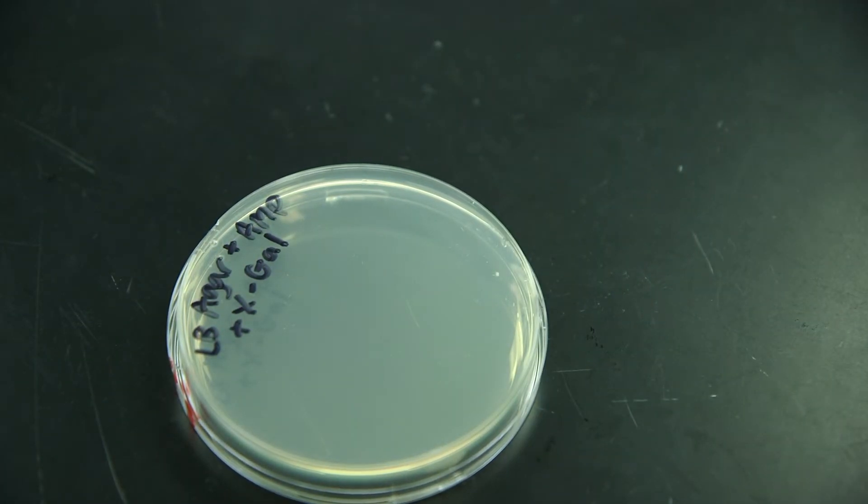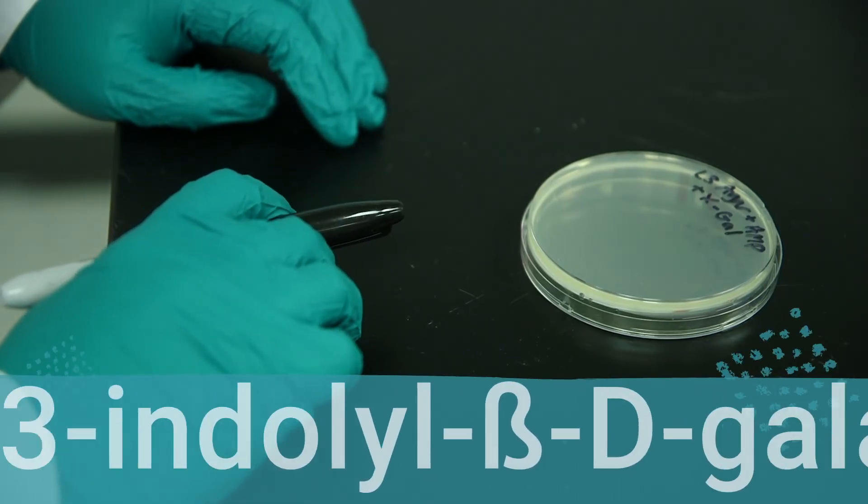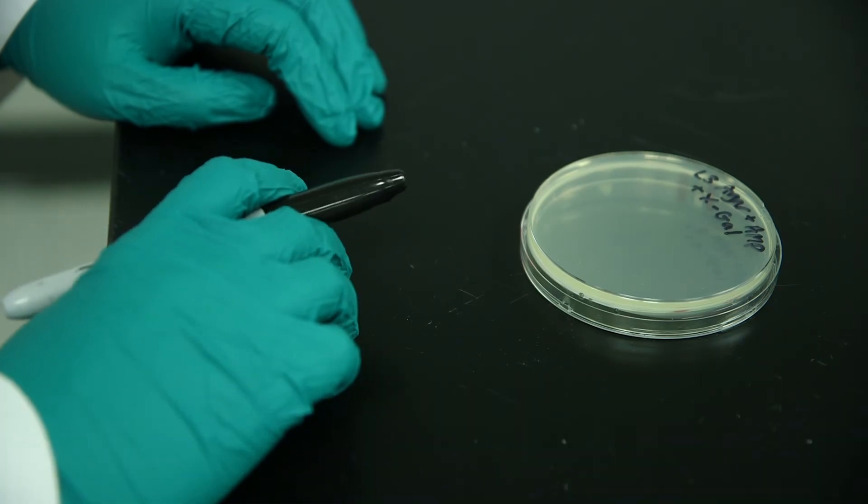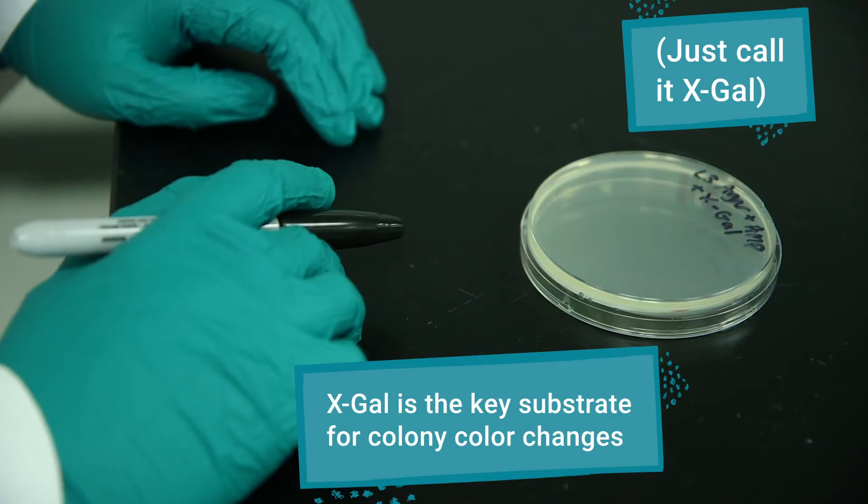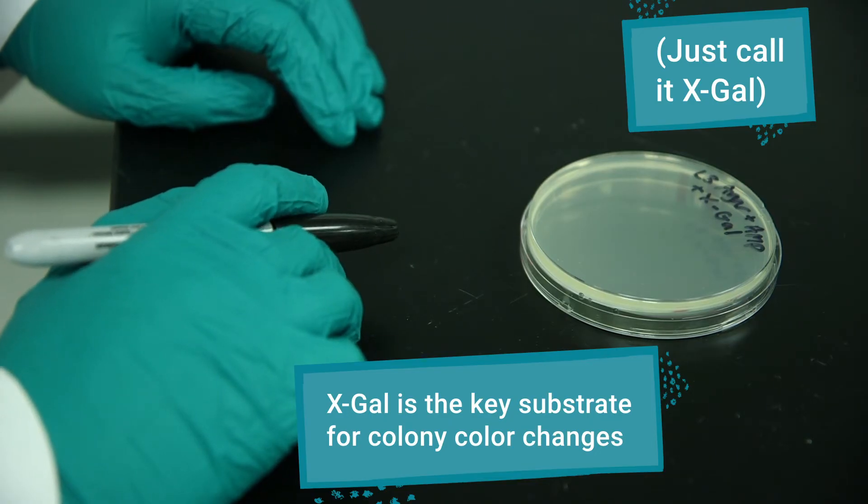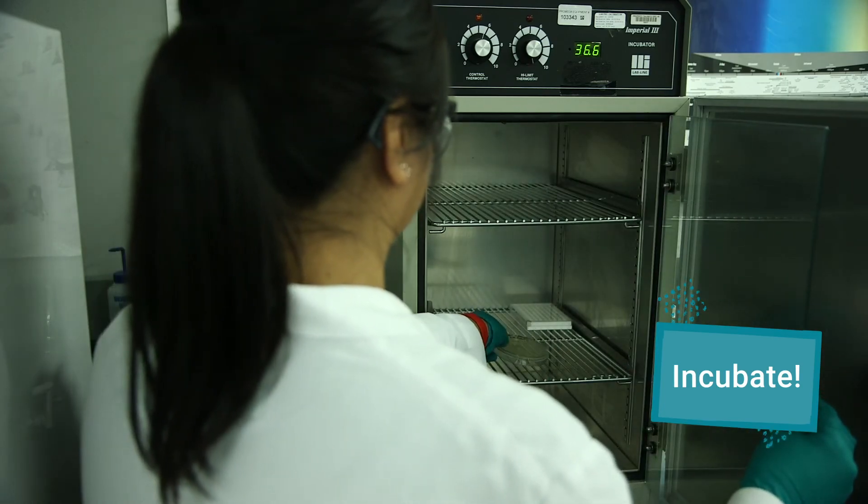For blue-white cloning, these plates should also be treated with 5-bromo-4-chloro-3-indolyl-beta-D-galactopyranoside. That's a mouthful! You can just call it X-gal. X-gal is the key substrate component for making the colonies turn different colors. Once the cells are plated, incubate them overnight as normal.